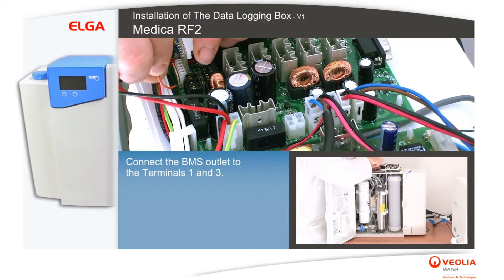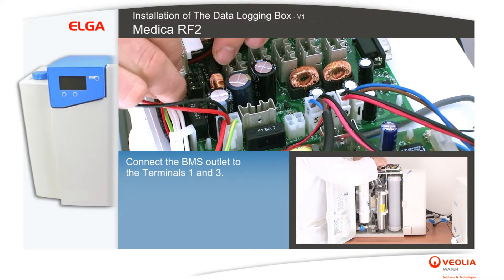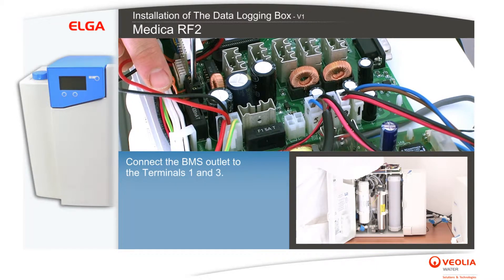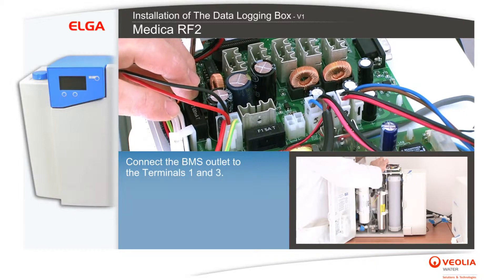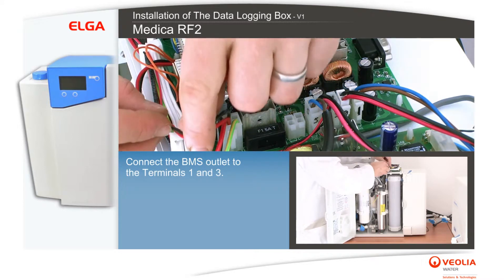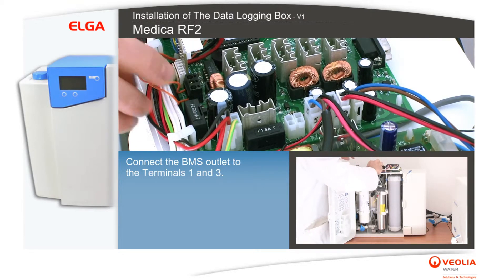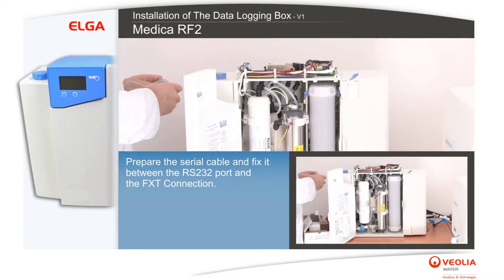Connect the BMS outlet to terminals 1 and 3. Prepare the serial cable and fix it between the RS232 port and the FXT connection.